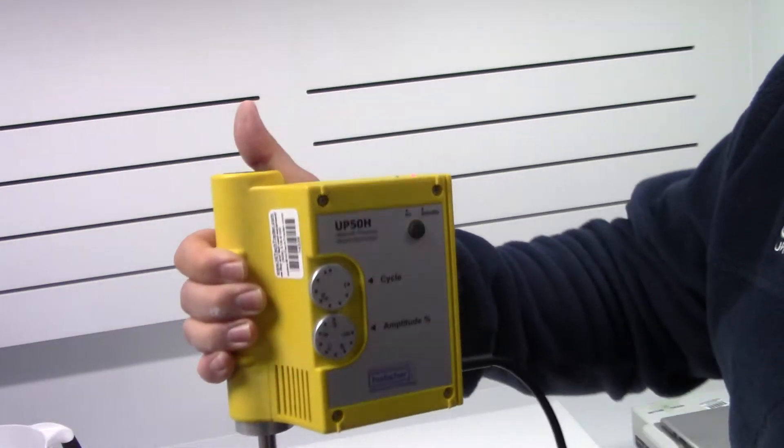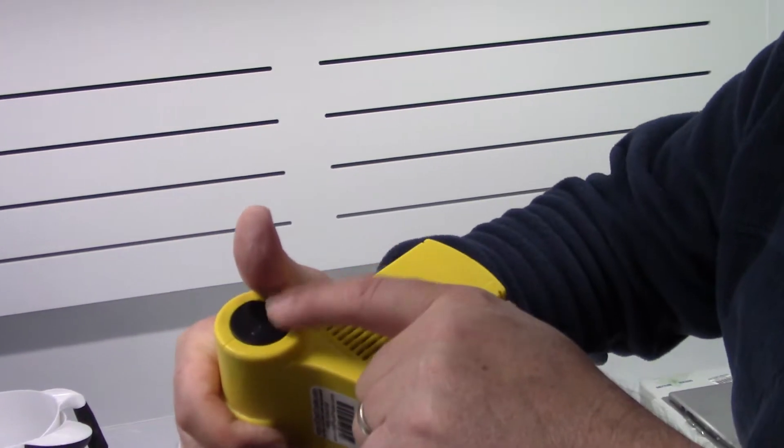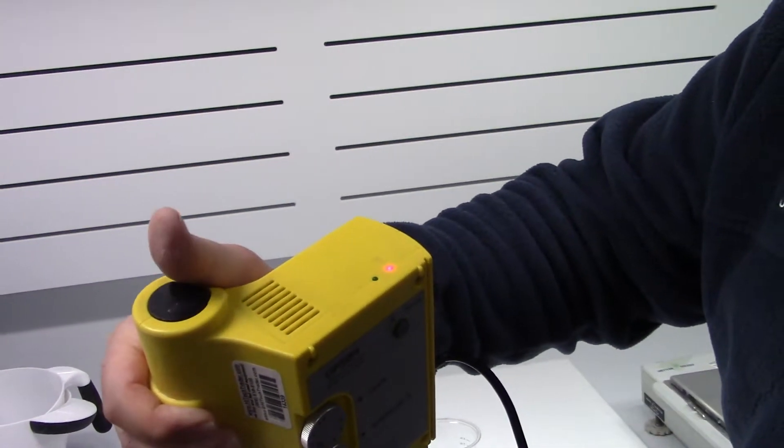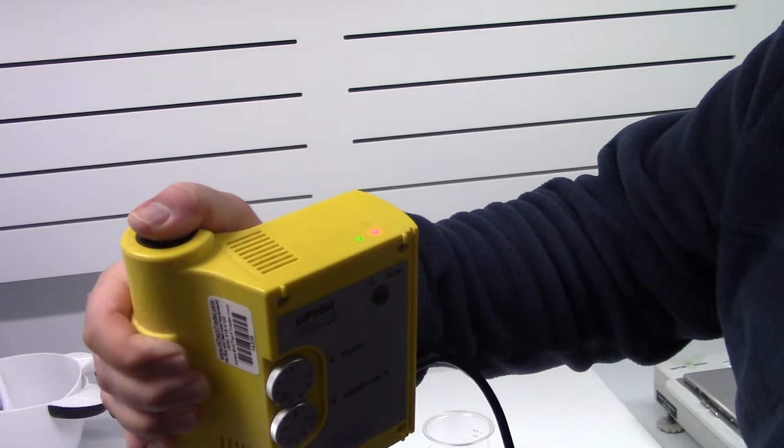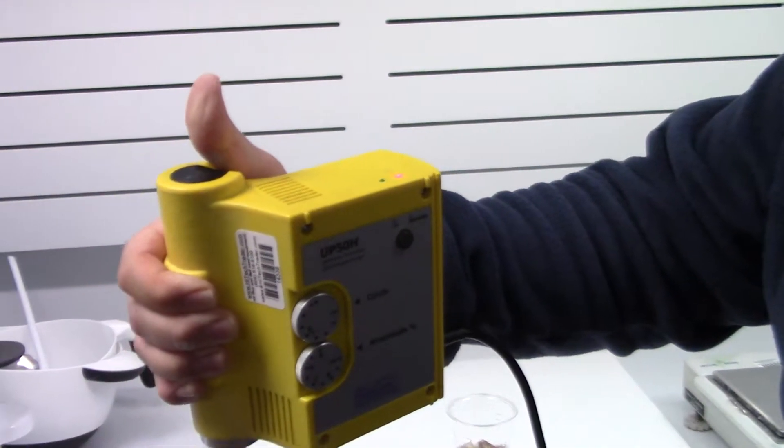A beautiful handheld instrument to start the sonication. You would depress the black button on top, and you'll also see a green light showing the sonicating. When you release it, the sonication goes off.